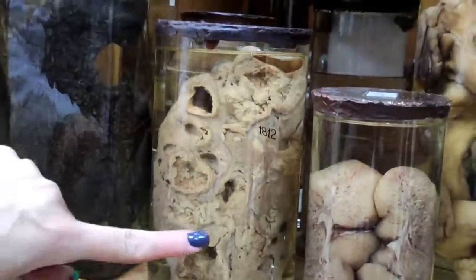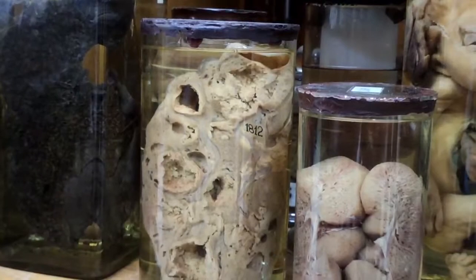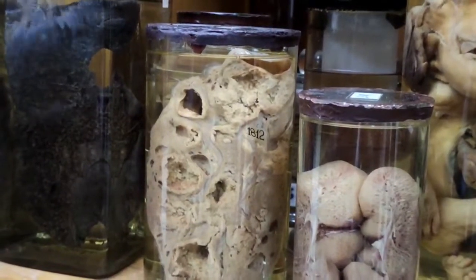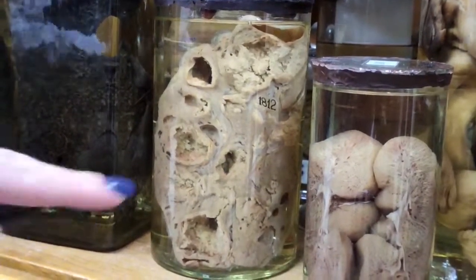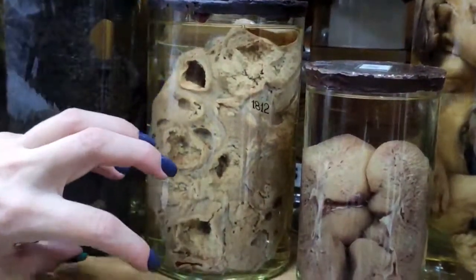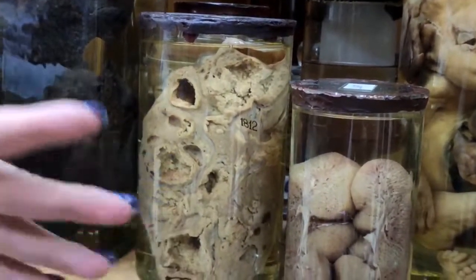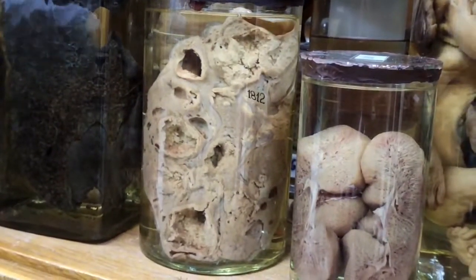So this is fibrocavernous, I guess, tuberculosis, because there is also secondary type of tuberculosis which can involve not only lungs as any other tuberculosis, but also other organs. And you can see a lot of cavities. Some of them are empty, some of them are full with necrotic masses, but still it can lead to, of course, chronic kidney insufficiency and amyloidosis in such patients.